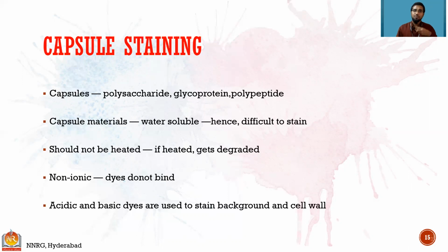Because of that nature, it will be difficult to identify under the microscope, because we will be washing with water and trying to impart color. Even if the color binds, when we wash with water it will vanish away completely. As a result, we won't be able to identify them. So some special technique is needed for that.